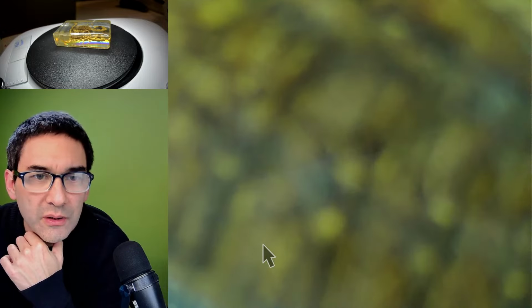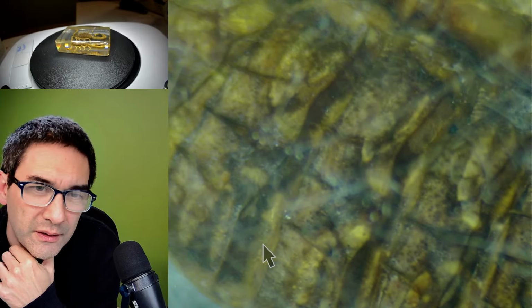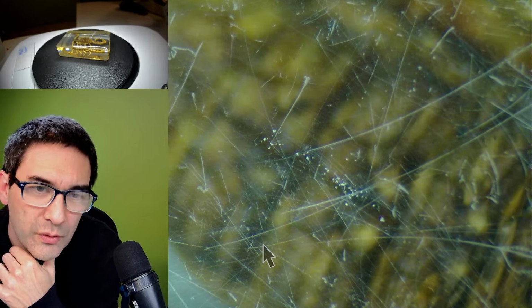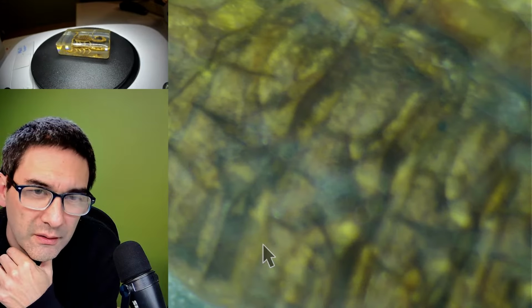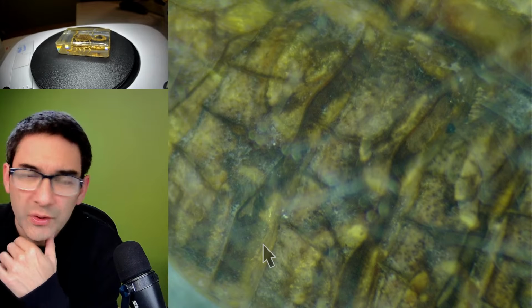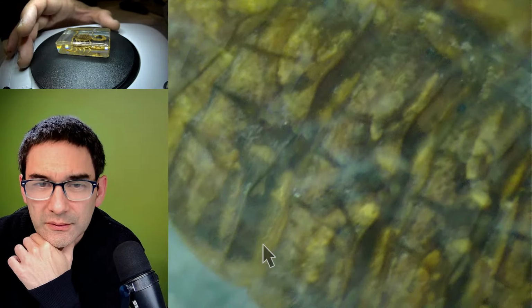Let's do it like this. And you see, here there's scratches, right? And now I'm focusing more on the surface of the animal. Okay.